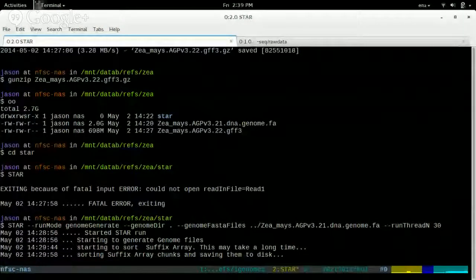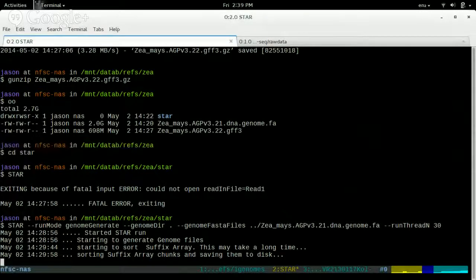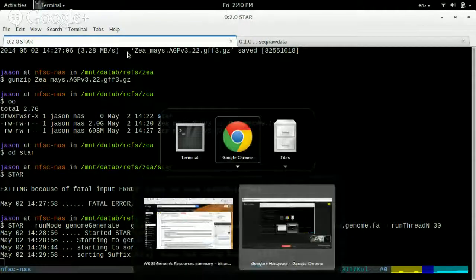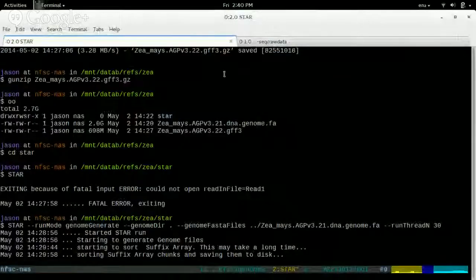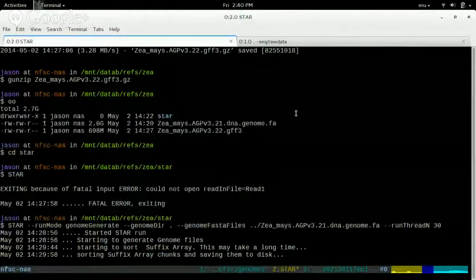And so that's, trying to think what I should show you next. First of all, is all this making sense so far? Well, I'm trying to follow along. Oh, okay. Well, stop me, or here's a perfect time. Start asking questions.